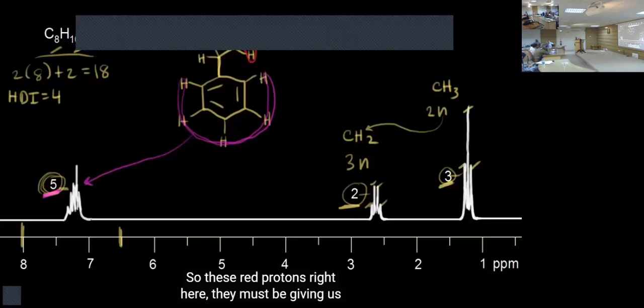Then I understand your question. You are saying that the 2 ortho protons should appear at the same position, with reference to the substituent, the 2 meta protons should appear at the same position, and the para proton should appear at one different position.